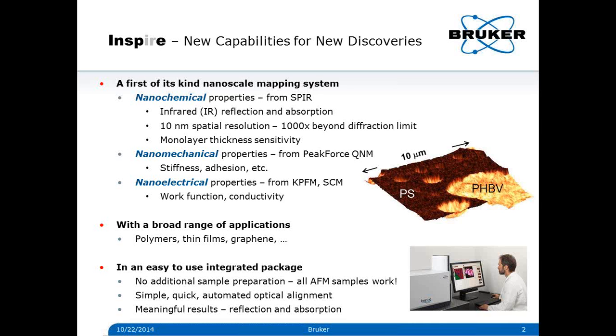I will also talk about the monolayer sensitivity that we have with this nanochemical imaging technique, and then I will focus on the combination of nanochemical, nanomechanical, and nanoelectrical measurements that you can do at the same time with the Inspire, because you can combine the SPIR technique with the exclusive Bruker technology of PeakForce QNM. And PeakForce QNM gives you, for example, the stiffness or adhesion of your samples or the modulus. So quite valuable information that you can combine with nanochemical information here.